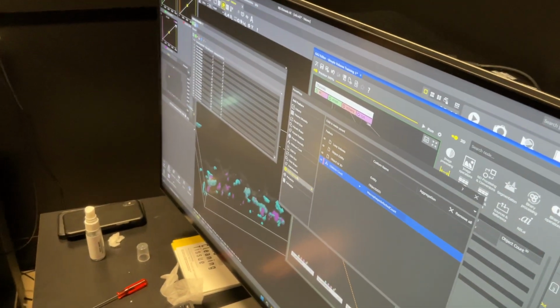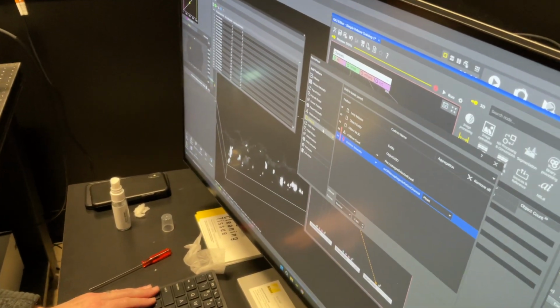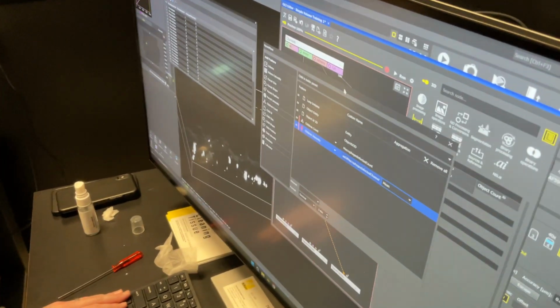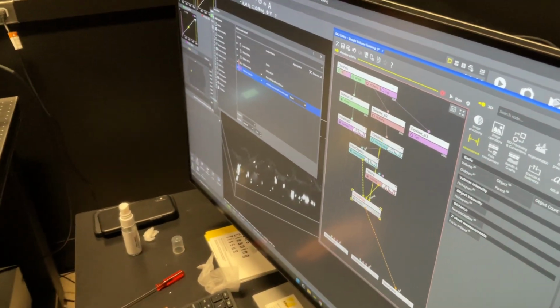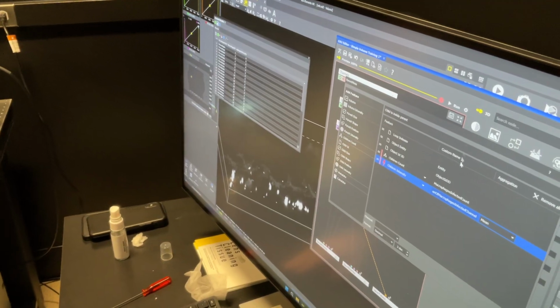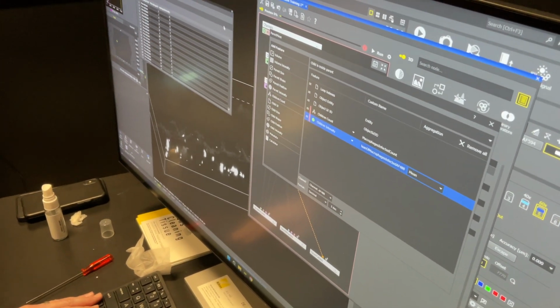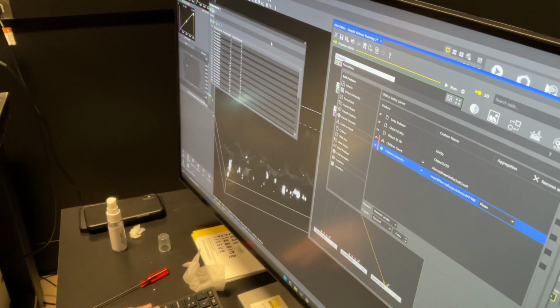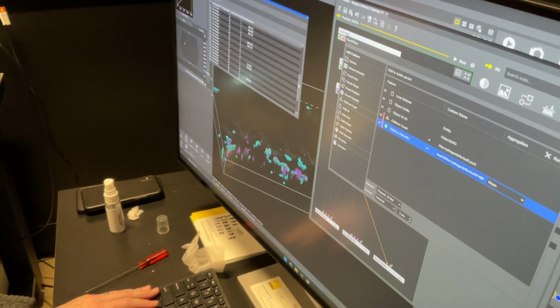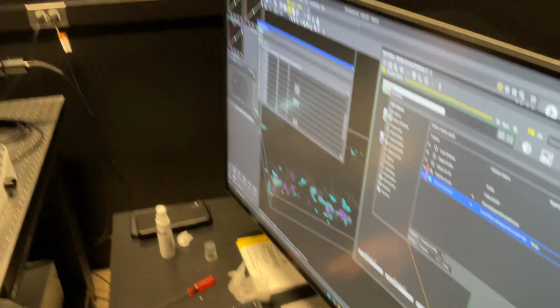Because you have a hard cutoff, where you're going to say, this is infected. Well, that's what I did in the other software. For the GFP, I made a threshold where if it has intensity above this, then I'm gonna say it's infected. If it doesn't, then I'm gonna say it's not infected. But then the output that I want is the third channel, the far red.